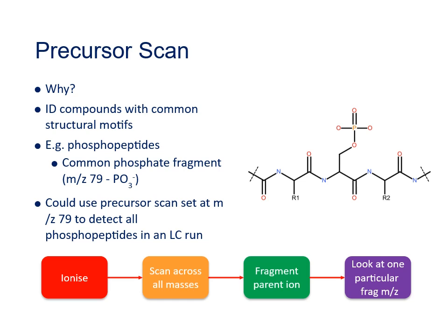The normal method of analysing such samples is known as bottom-up proteomics. So in this case, you might take a complex sample like a piece of tissue or blood plasma, use an enzyme to digest all the proteins in it down to peptides, thousands and thousands of peptides, and then analyse these in a tandem mass spectrometry run. But because we're interested in which proteins are phosphorylated, what we want is an easy way to identify which of the many, many thousands of peptides in this sample have been phosphorylated.